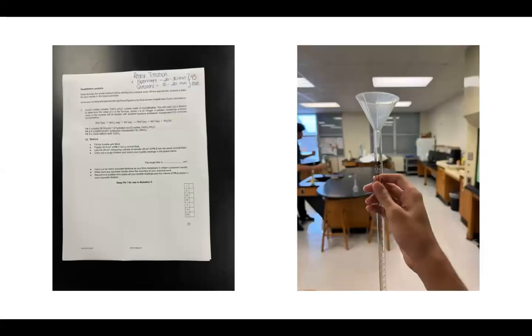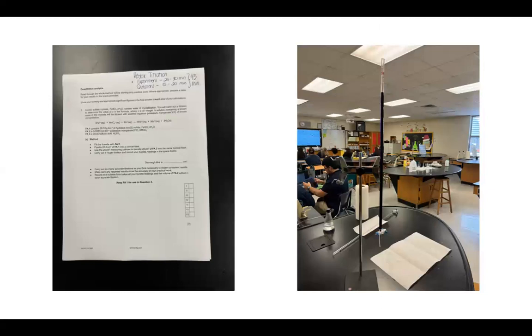So the first step, it says to fill the burette with FA2. We're going to need the funnel and then the burette. Make sure that the burette is both clean and closed. You know it's closed if the stopcock is horizontal, or perpendicular to the burette. If it's vertical, then you know it's open. Horizontal, it's closed. So you're going to put this plastic funnel into the top of the burette and then pour in the solution. Remember to hang it onto this burette clamp.